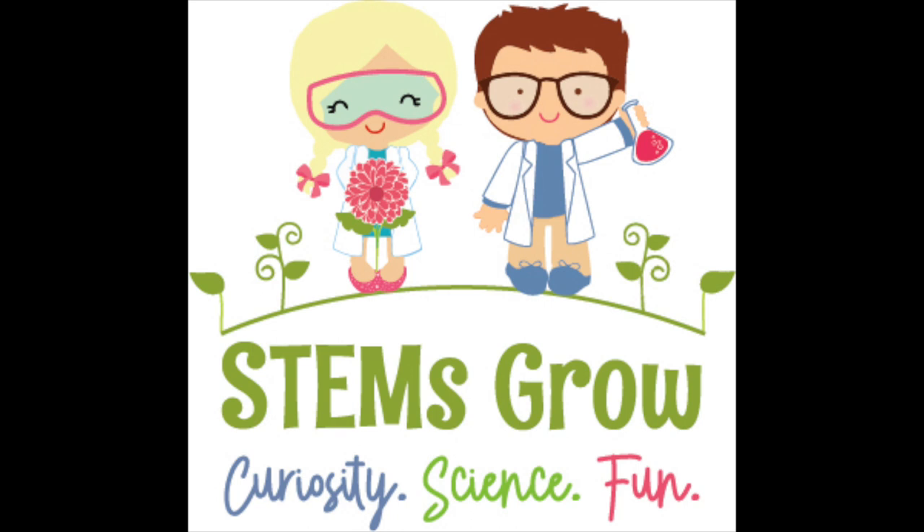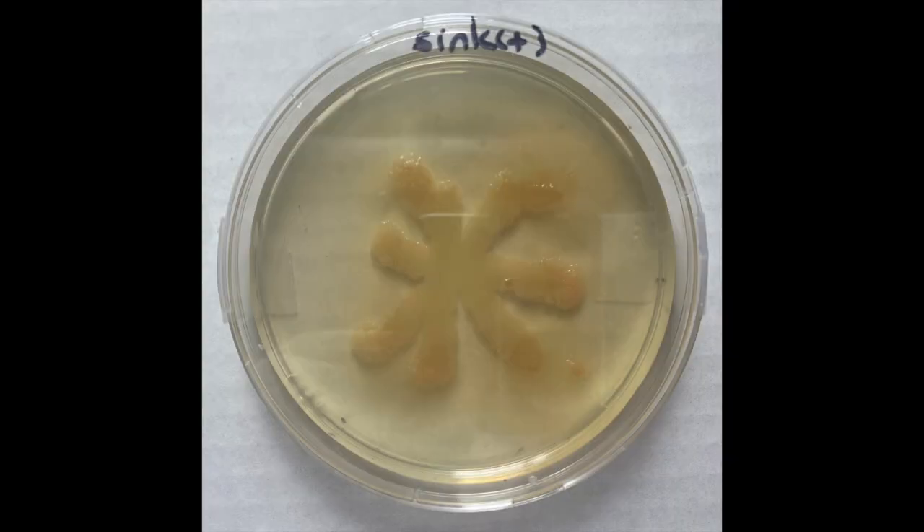We're at day seven of our bacterial plating experiment, so let's take a look and see what our plates are showing us. The first plate we're going to look at is our positive control, which if you remember, this was our sink drain.